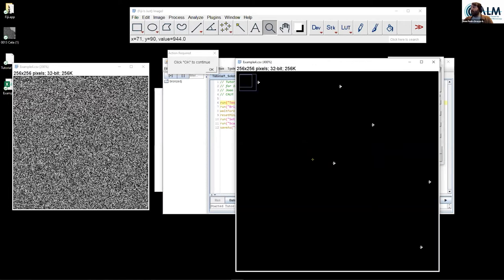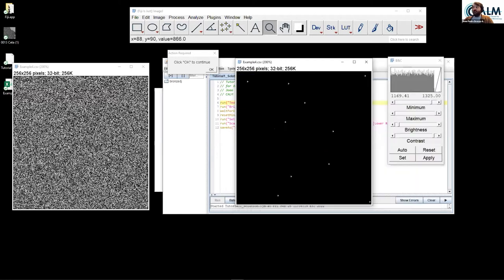They were all exactly the same size. And they are 3 pixels in length. So I know now that 3 pixels equates to 0.45 microns. However, the question was, apply a scale bar to the original file, not to this hidden thresholded image. So now that I found the dimension that I'm looking for, I'm not going to apply this transformation because this will change the pixel values of my image. I'm just going to click on okay.